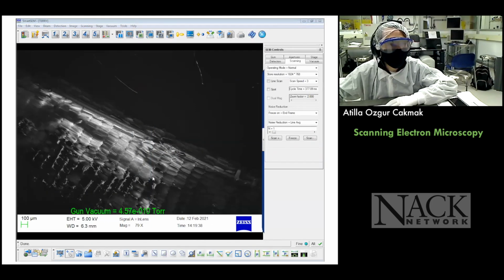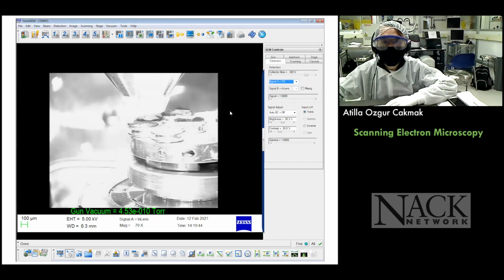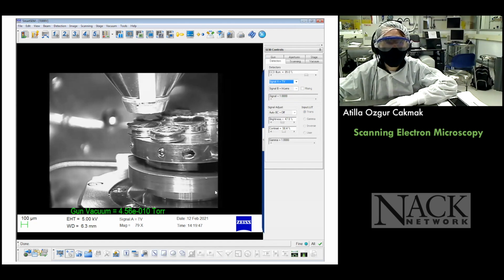Okay, so hopefully you can see the screen here. Let me show you first where things are. This is now an image from a normal camera view of our electron microscope. This is the pressure that I was talking about, 10 to the minus 10 torr. Remember, we had to pump out all those particles. So this is the electron column, the gun column that I was referring to. Somewhere up here, we have the electrons coming in and then hitting the samples. The samples are located in here.